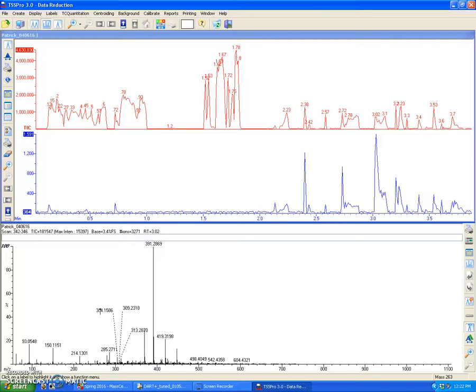So it's adequate enough to do an elemental composition analysis later on. But the reason why this is slightly in error is because it's not a high enough abundance to get a good centroided mass spectral peak signal. But in this case, it's fine, it's doable, we know that it's there, and we know that it's cocaine.